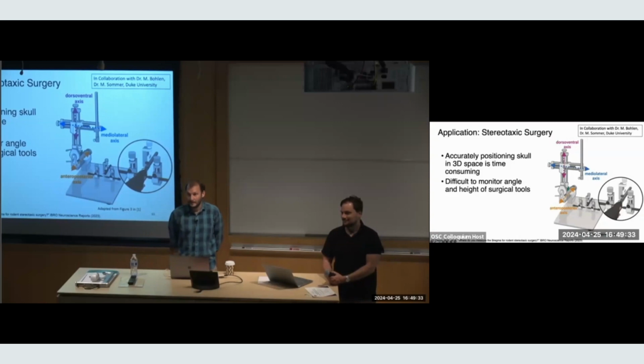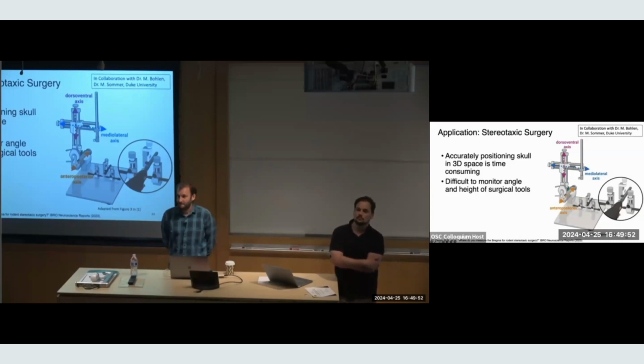I had a question. I've attended a few talks about the zebrafish imaging before, and I remember a particular discussion about previous single-microscope imaging systems that ran into this problem: with one microscope you have to confine the zebrafish, so you get a sad, angsty zebrafish that does all the things that are not helpful for science. I remember that's the reason we wanted to expand the region, so that the zebrafish would be a happy zebrafish that actually went hunting and stuff like that.